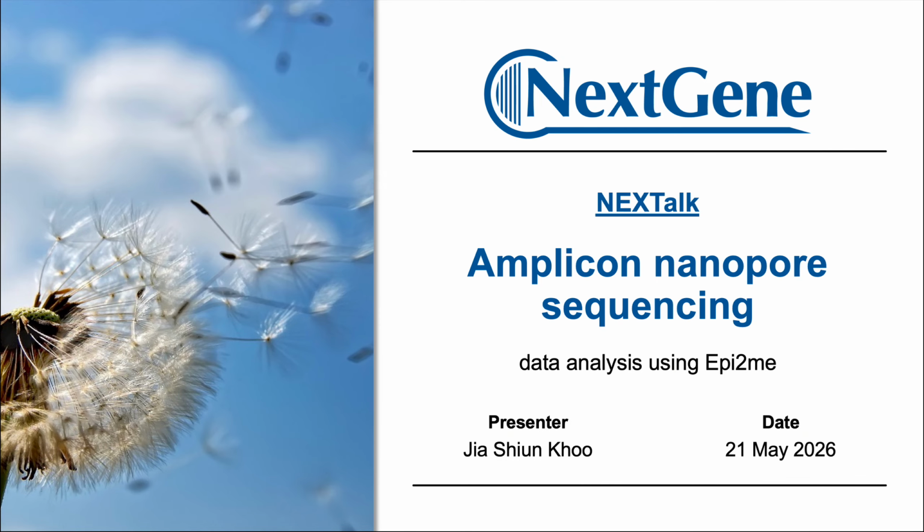I also want to emphasize one more thing. Even though 16S has been widely used to identify the species in our samples, the identification is only based on one single gene that is around 1.5 kb in size. So for some species that have very similar 16S, we can maybe identify them up to the genus level, but it is hard to tell in detail whether they belong to a specific species.